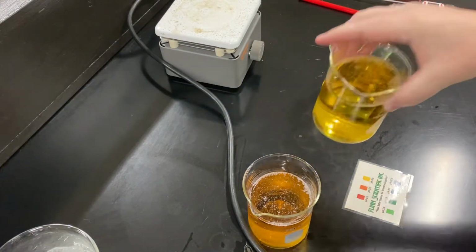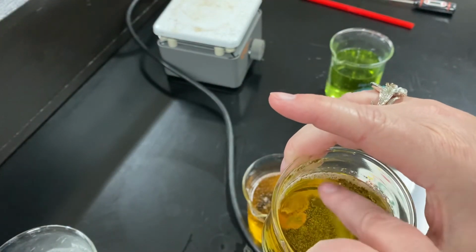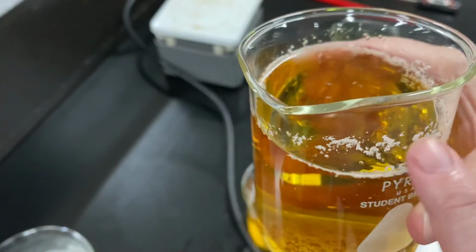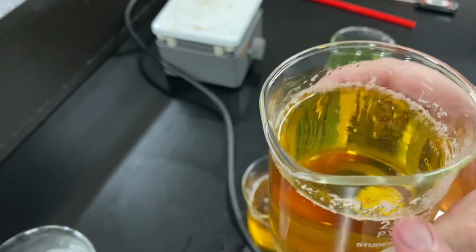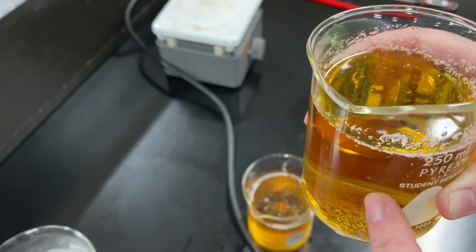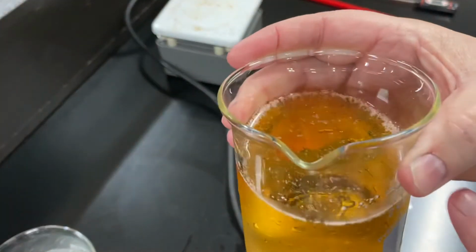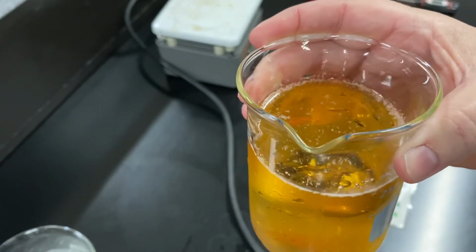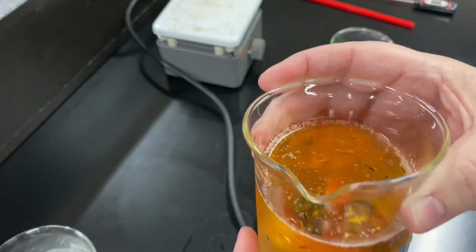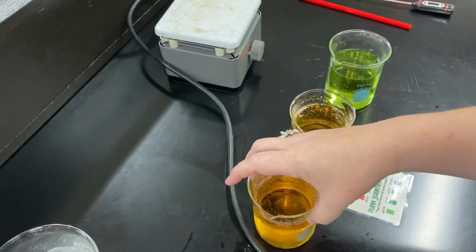If you look at the room temperature, you can see along the edges here, it's up against the rim of the glass. You can really see it right there. There's still some solid left over. So since there's definitely some solid left over, this is a saturated solution. The cold one, we can also see lots of solid. The solid's not always at the bottom. In this case, the solid is less dense than the water, so that's why it's floating up at the top. But you can definitely see lots of that solid floating in there.